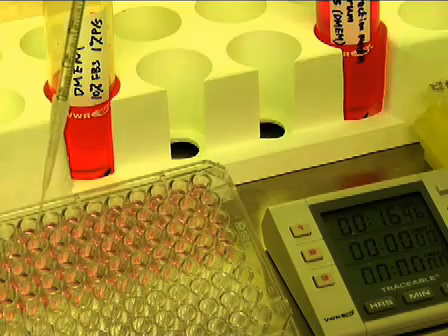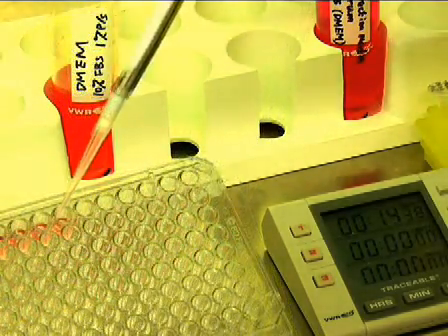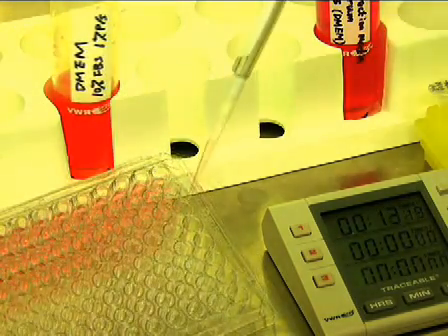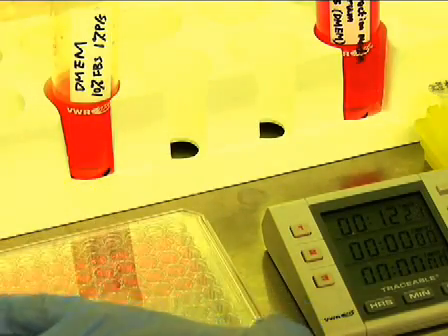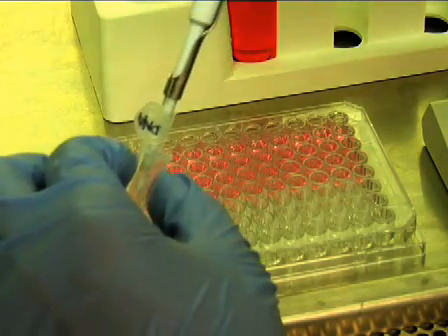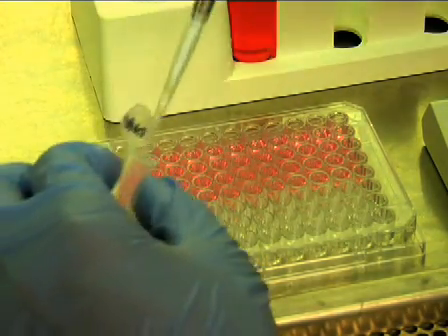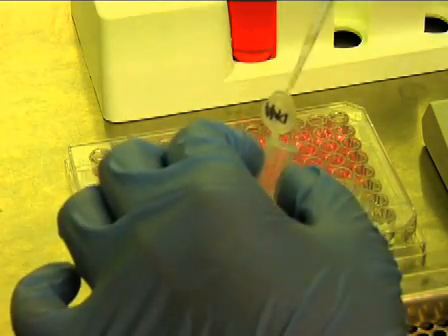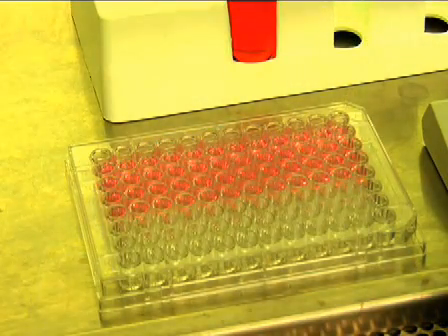During the 20-minute incubation, remove the media from the 96-well culture plate and replace it with 90 microliters of fresh medium A. Once the incubation is complete, add 10 microliters of the DMEM DNA TransIT-293 mixture to each well. The mixture should be pipetted directly into the existing liquid. Don't let the pipette tip touch the wall of the well.